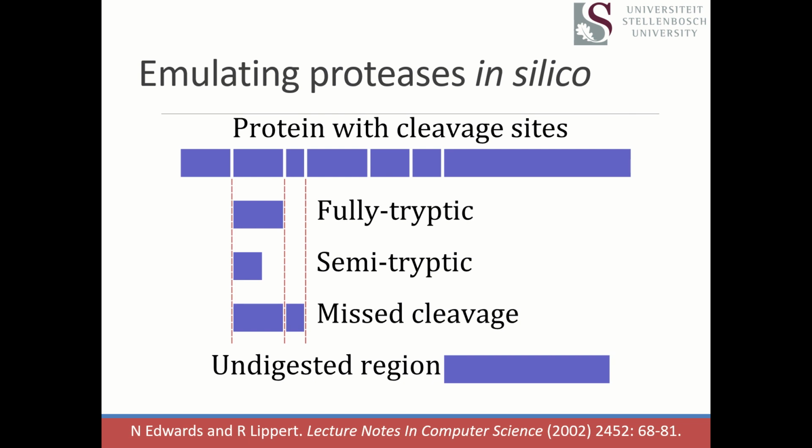There's also a large number of peptides called semi-tryptic peptides, especially when you have samples that are dominated by just a few proteins, or samples that have a lot of endogenous proteases doing stuff. Seeing semi-tryptic peptides can be a bit of a catch-up, so I want to make sure you're aware that they do in fact happen sometimes. So it may be that it's a peptide that starts at a legitimate trypsin cutting site, but that doesn't extend all the way to the next one. Or it could be that it starts somewhere in the middle here and runs to a legitimate trypsin cutting site.